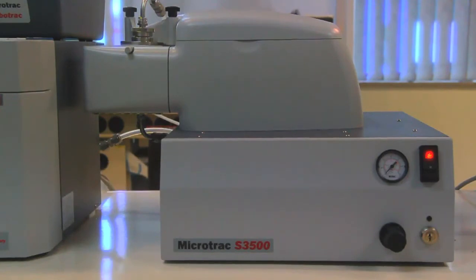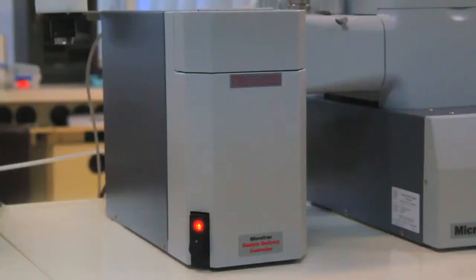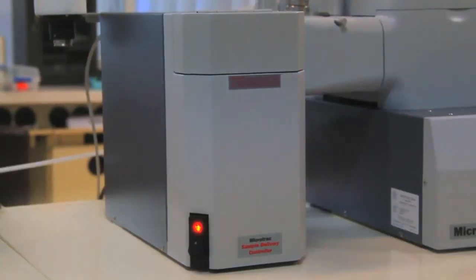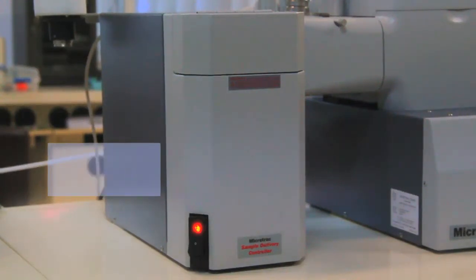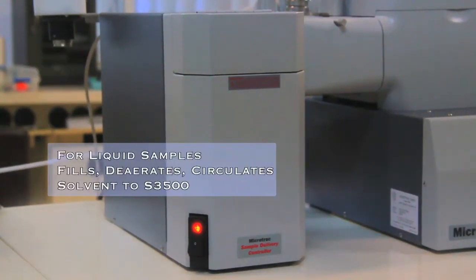This is used to analyze the particle size of the samples. The Sample Delivery Controller or SDC is used to provide high sample consistency to the S3500.